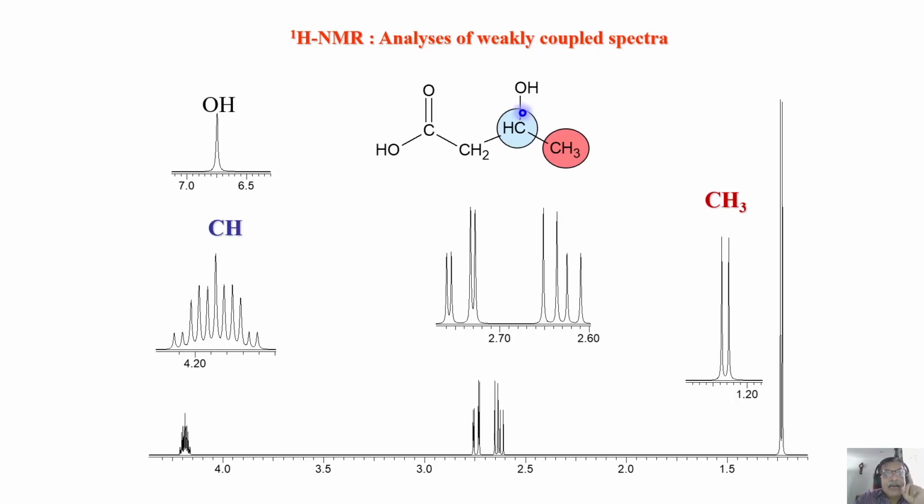Remember my statement. I said because of CH3 it will be a quartet. But further, in our understanding, if it is coupled to the CH2 group, each line of the quartet must be a triplet. But I'm not stressing that yet. There's a different reason for it.